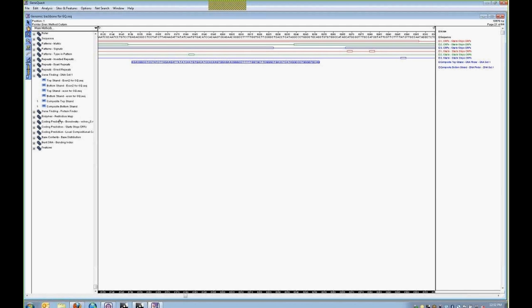Yeah, we actually have a lot of questions coming in, and we have just a few minutes, so I'll ask as many of them as we have time for. But again, we can follow up with people later. One just general question about GeneQuest. Can you talk a little bit about what kind of input files you can give GeneQuest? What kind of files you can open in GeneQuest?